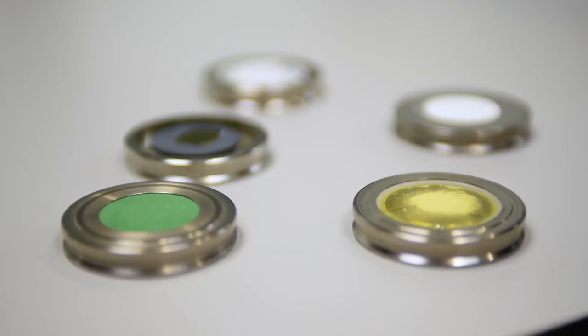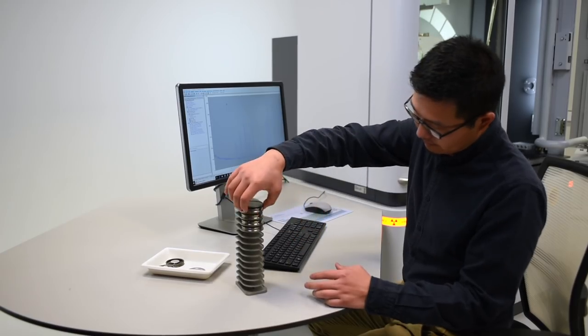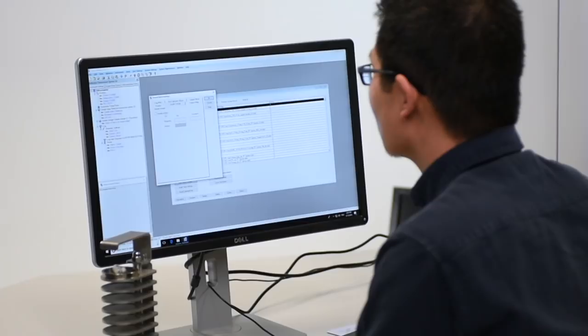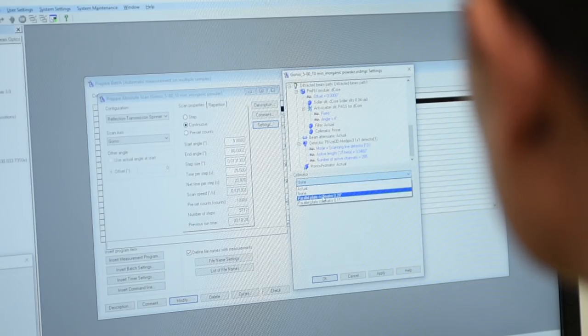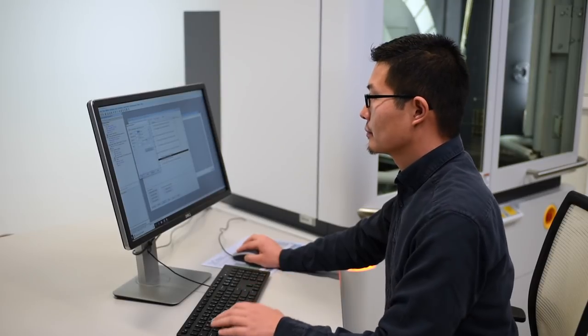With the new Empyrean with multi-core optics, you can prepare batches of different measurements to run overnight or in the weekend, therefore maximizing the usage of your x-ray platform and increasing its efficiency.